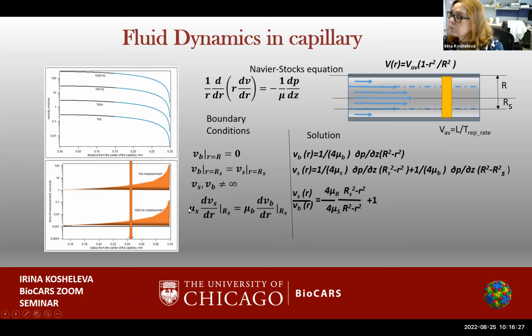So therefore, there is a problem with radiation damage, and also the problem that potentially the sample can experience multiple pump probe cycles, which is also not good and can affect our time resolved signal at least partially.